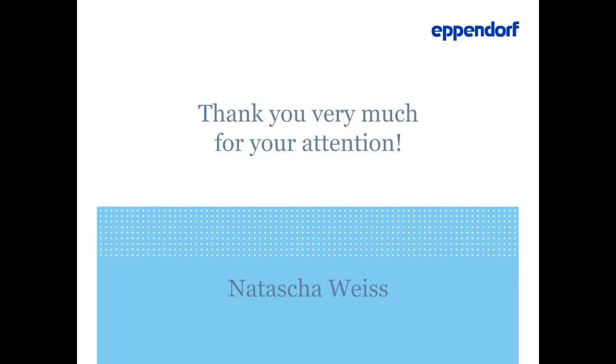Yeah, if you have a highly concentrated sample, I would generate a dilution with a defined buffer and measure this solution instead. Then the effect of the original buffer may be negligible. Otherwise, trying a buffer which is commonly used in your lab for eluting or resuspending samples may be reasonable. In this case, I would recommend to check the complete spectrum. If it looks fine, you can assume that the right buffer was found. If the results are not satisfying, the best way will of course be to precipitate the sample and resuspend it again.